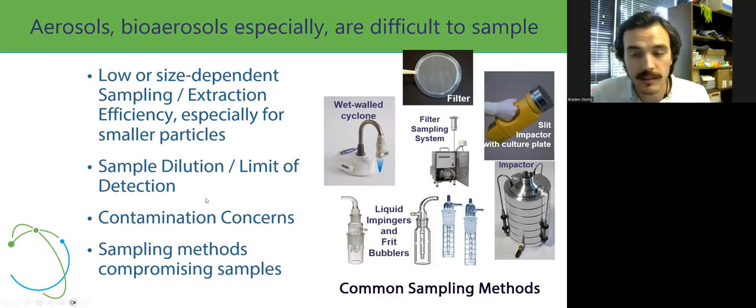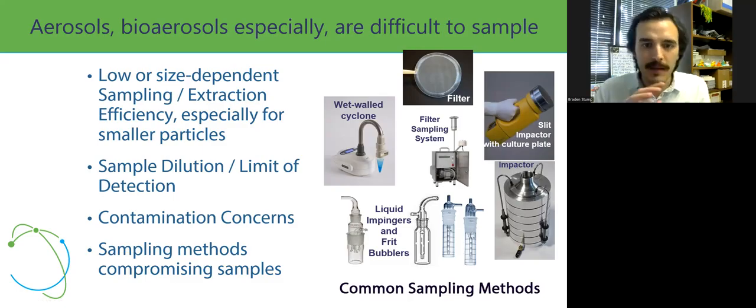Additionally, if you're sampling into something that is diluting itself over time, you worry about your limit of detection on your downstream process where you're taking this aerosol sample. Also, not for all sampling techniques, but you do worry about sample contamination, and the ability to clean and decontaminate instruments. Those are all pretty big, especially in the bioaerosol world. And then finally, sadly enough, sampling methods can compromise the integrity of your sample, exposing it maybe to high heat or a liquid or solution that you wouldn't want to expose it to, which could degrade the integrity of what you're trying to sample as you're sampling it.